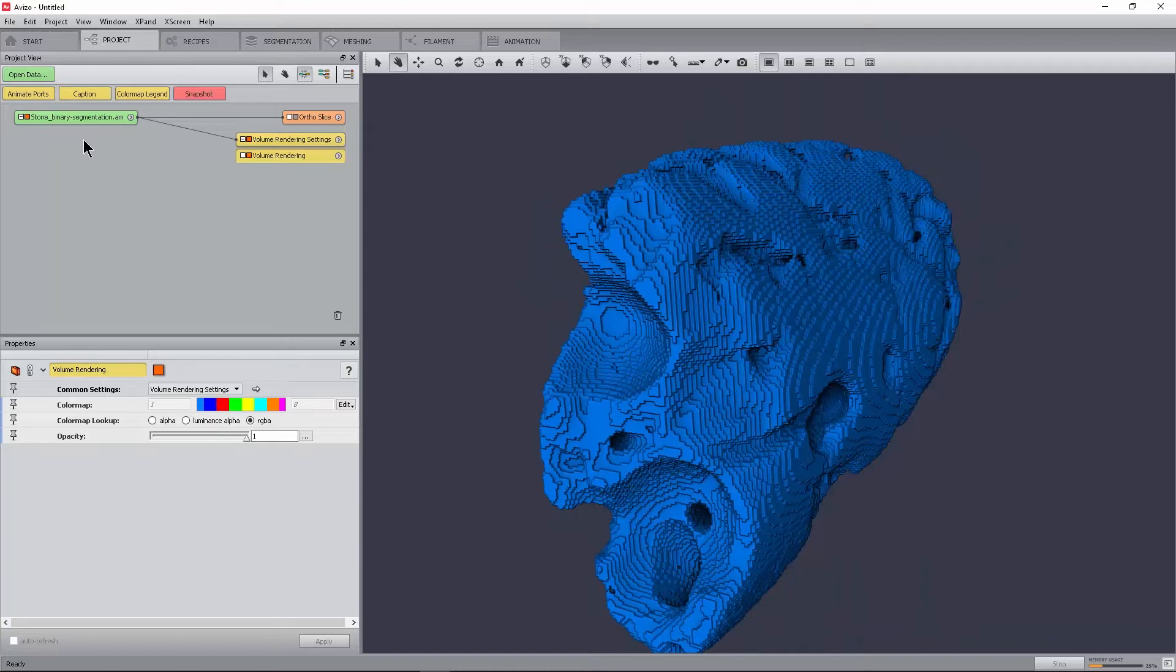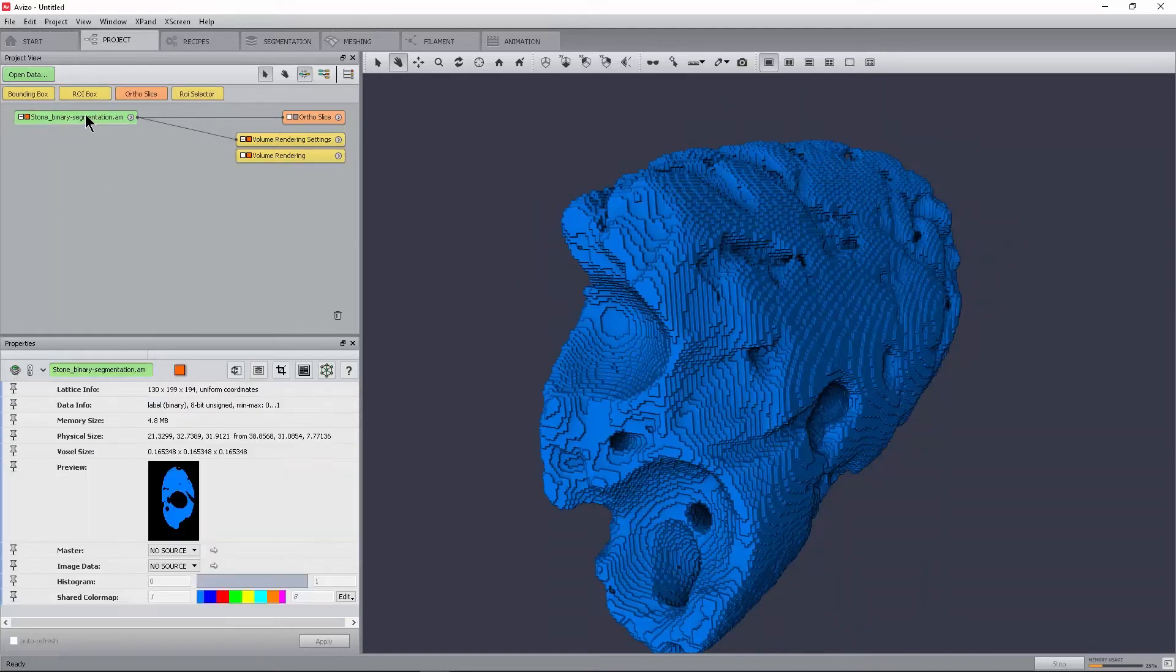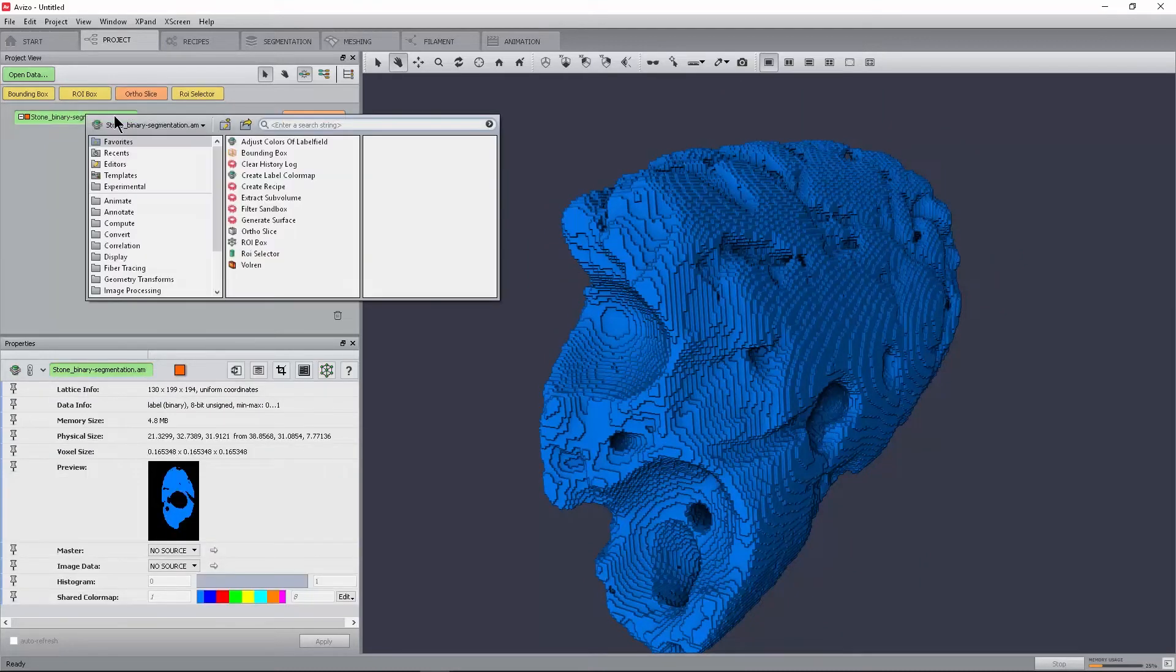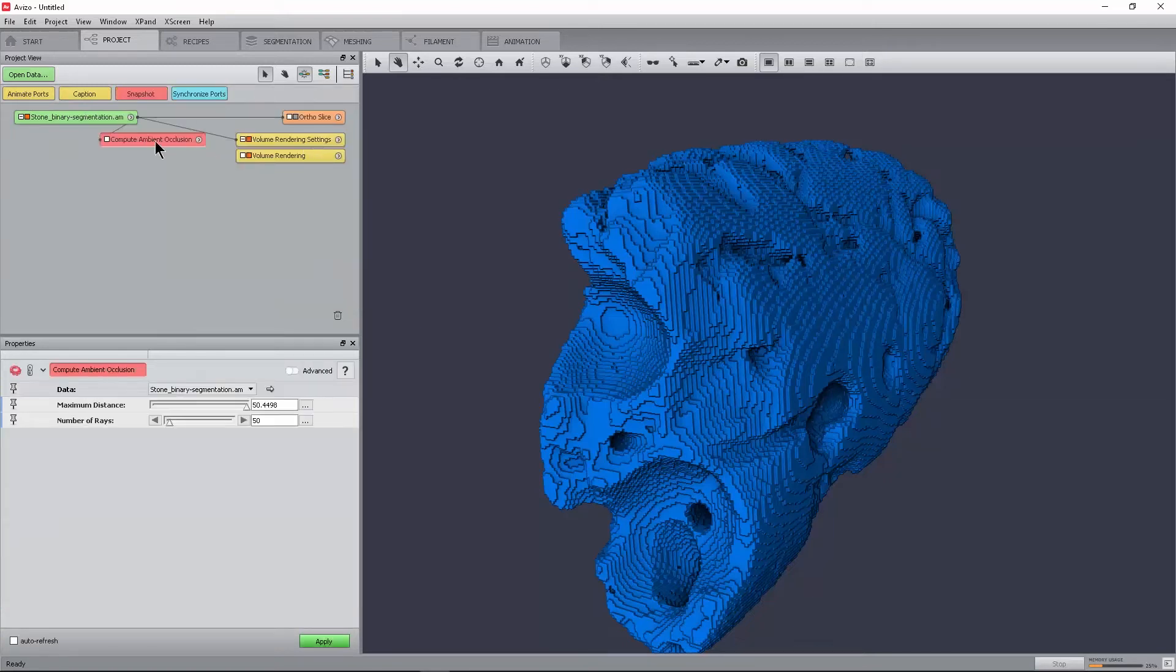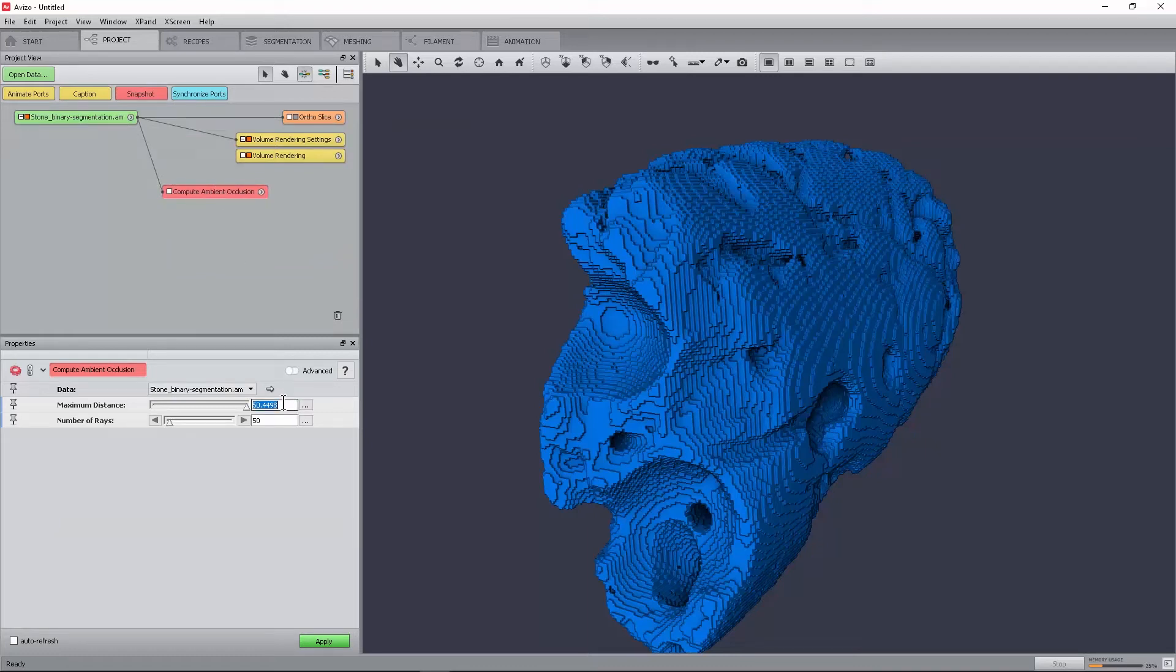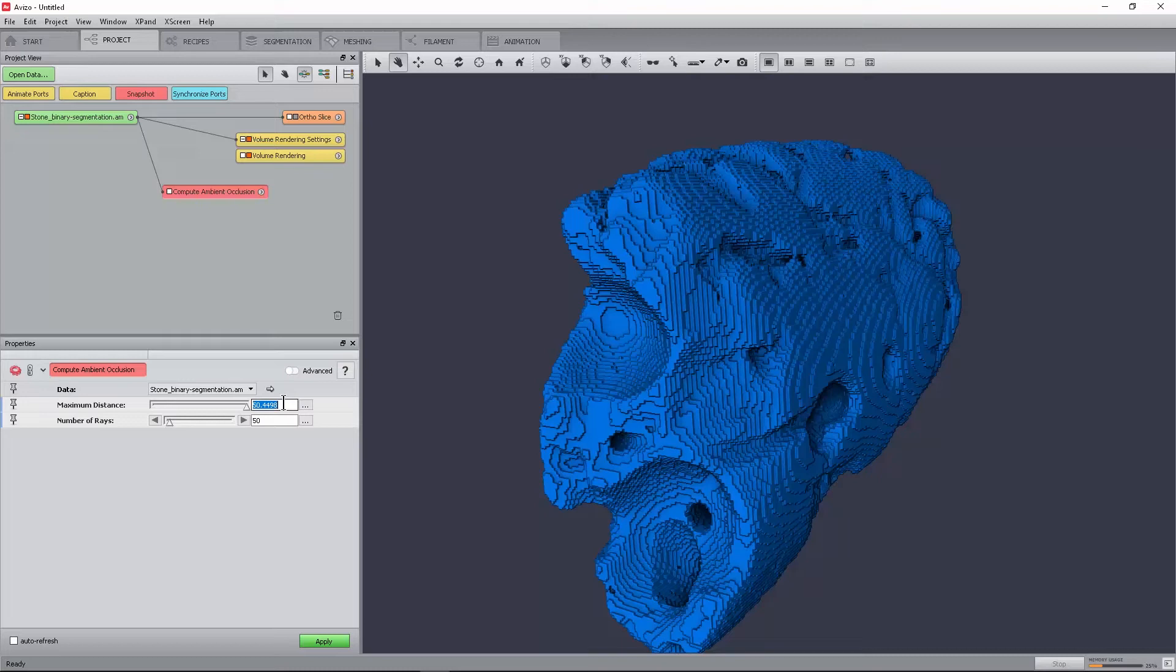We start with the computation of the ambient occlusion field. Attach a compute ambient occlusion module to the StoneBinarySegmentation.am object. The default value of the maximum distance port is set to its maximum. This ensures that the rays being cast do not terminate before either reaching the foreground voxel or the bounding box. In order to speed up the computation, this value should be decreased.